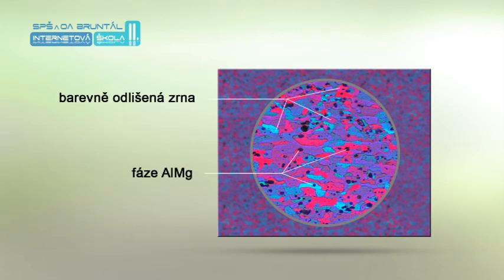In this strip image, grains are color-differentiated and observation is performed in polarized light. Polarized light is obtained by birefringence using Nicol prism and is used when monitoring single-phase structures like aluminum and its alloys to enhance contrast of individual grains. The black dots we see in the image are aluminum-magnesium phase and these images are used to evaluate grain size according to customer requirements.